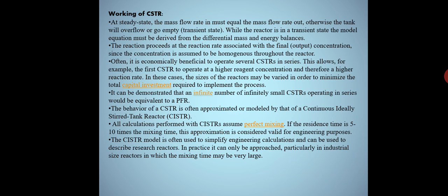अगर इसके एप्लीकेशंस देखे जाए, एप्लीकेशंस ऑफ CSTR, इट इज मेनली यूज्ड फॉर द वेस्ट वाटर ट्रीटमेंट, प्लस इट इज यूज्ड फॉर द परफेक्ट मिक्सिंग ऑफ द केमिकल्स। ये केमिकल रिएक्टर है, so it is used for perfect mixing of the reactor, and it's mainly used in the industrial processing, means at the large scale. So this was overall view about the CSTR, the design, the working, applications and advantages of CSTR.